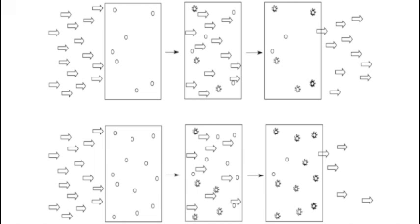If we were to double the concentration of a solution, we would now have twice as many solute particles in the same amount of space, so we can anticipate that more photons will come into contact with particles, and therefore that more will be absorbed during their journey through the solution. This illustrates that solutions with higher concentrations will absorb more light.